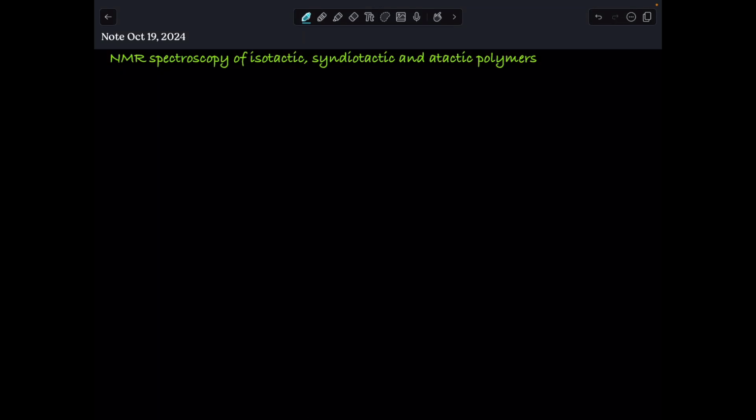In this video, we are going to study NMR spectroscopy of isotactic, syndiotactic, and atactic polymers. This is polyethylene.